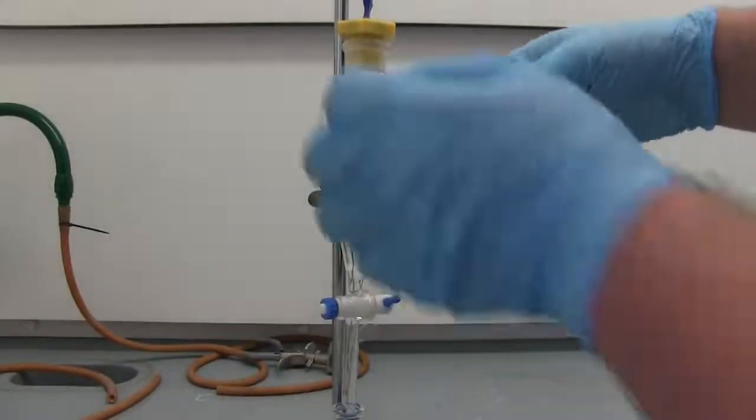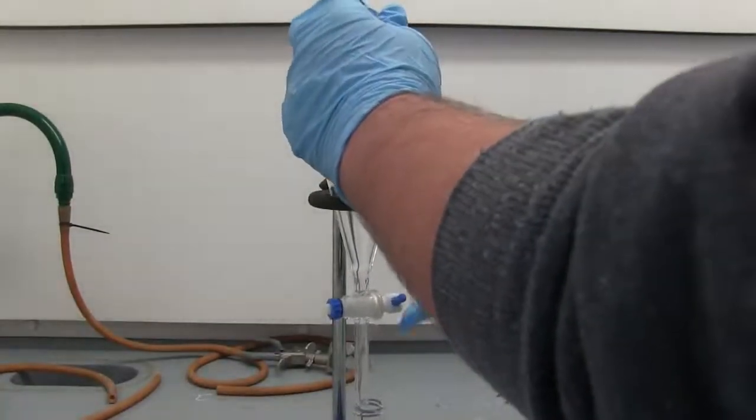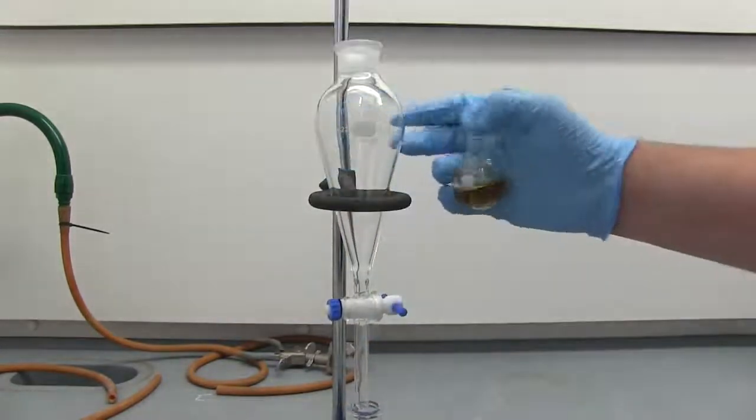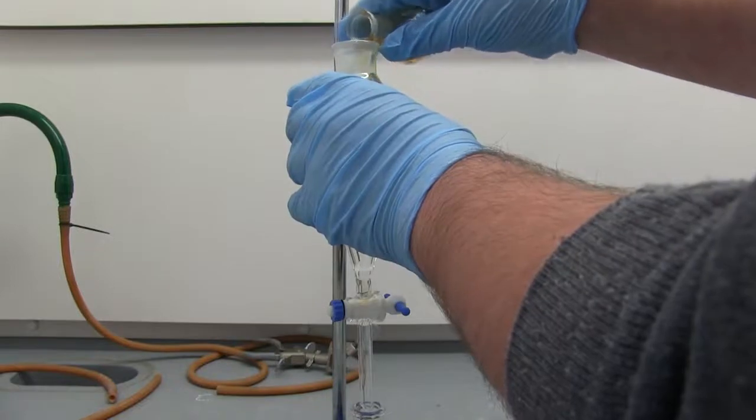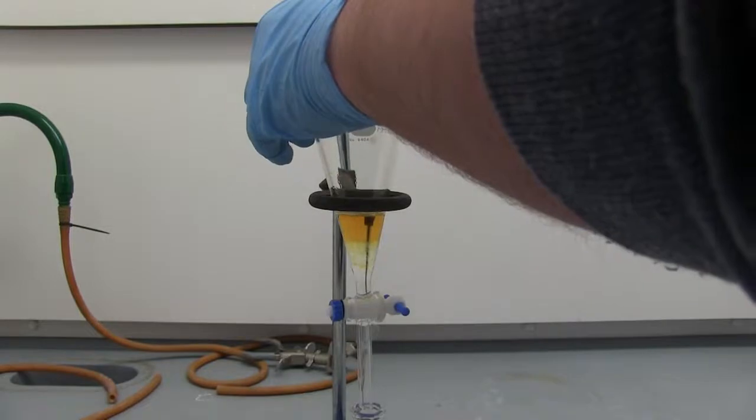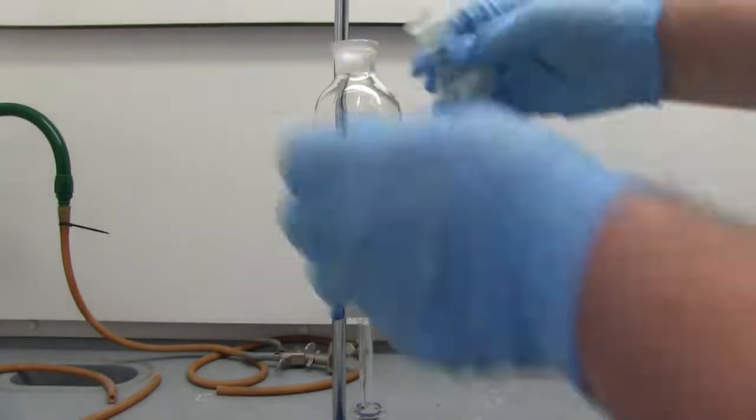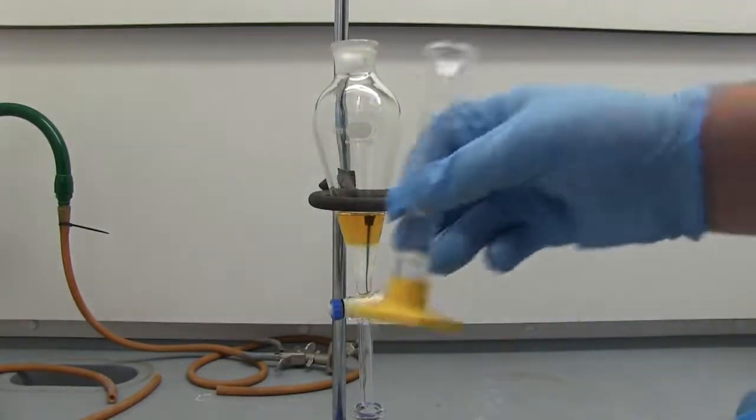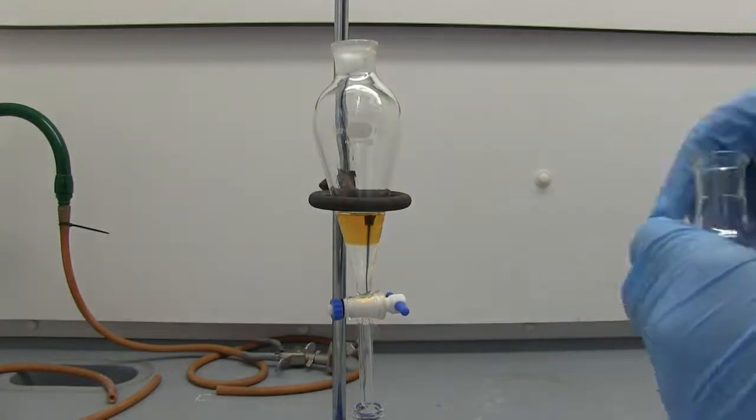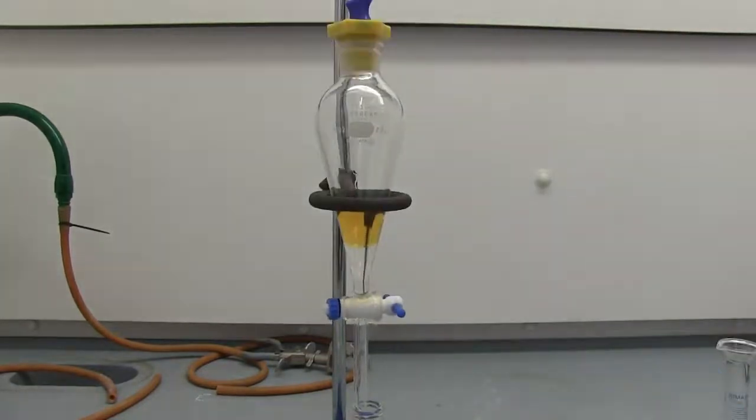All right, so now we've got our mixture. We're going to pour it into the separatory funnel, make sure it's closed. All right, and we've got 5 mL of DCM we're going to use to help transfer the solution.